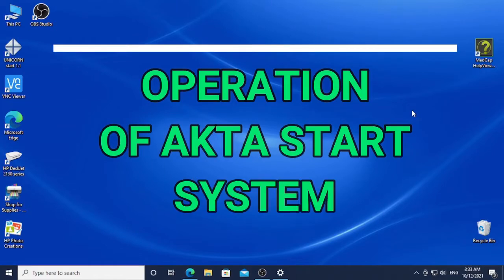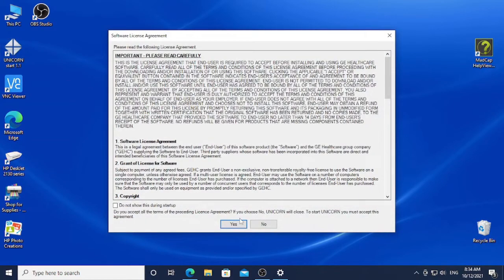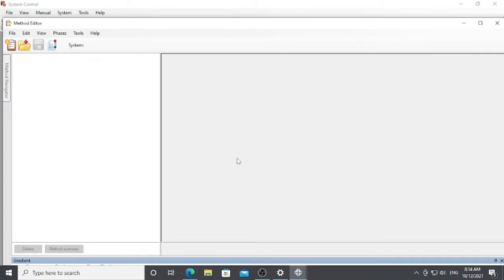Now I am going to teach you how to operate the size exclusion chromatography using the software system. The software we are going to use is Unicorn Start 1.1 — it is a slightly older version. In order to control the operations of the ATASA system, we are going to select System Control.